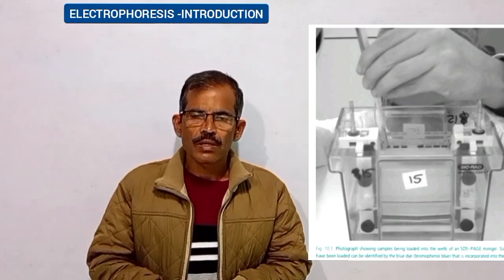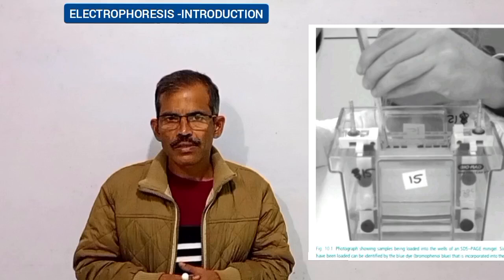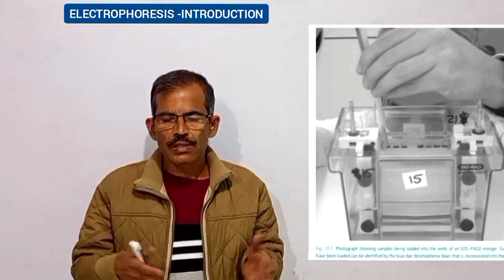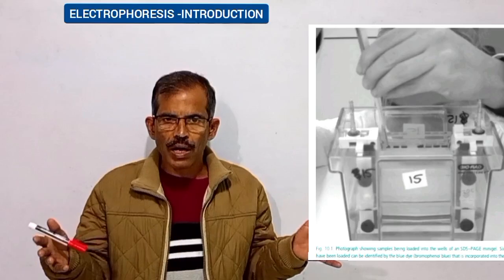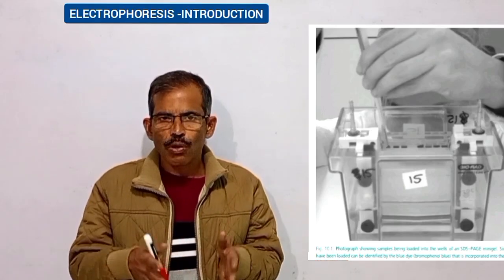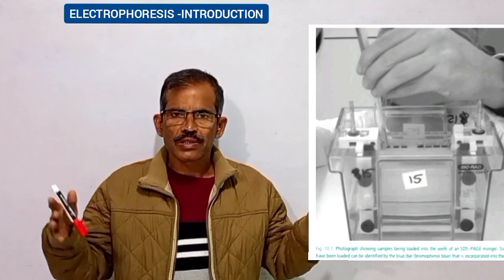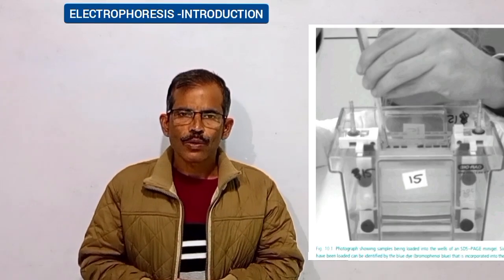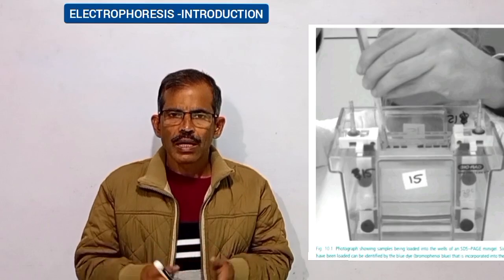Upon suspension in an aqueous solvent, almost all particles such as red blood cells, bacteria and many biomolecules acquire either positive or negative charges.